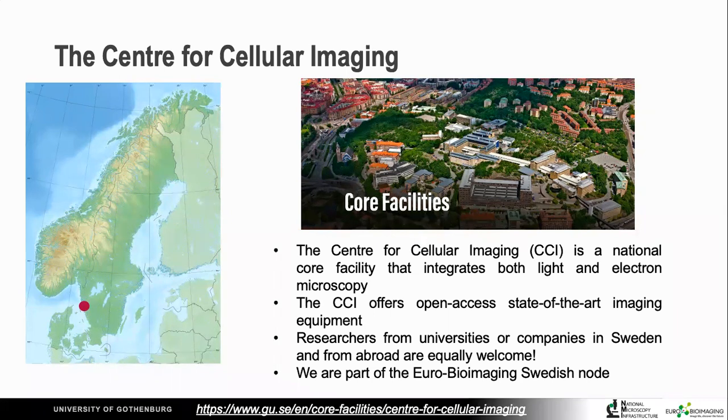But our standard way of working is that we will train you in using the microscopy equipment, so you can be independent as soon as possible. We welcome researchers from universities and companies in Sweden and abroad, and we are also part of Bioimaging. So people coming from abroad might enter or apply for service via the Bioimaging website.